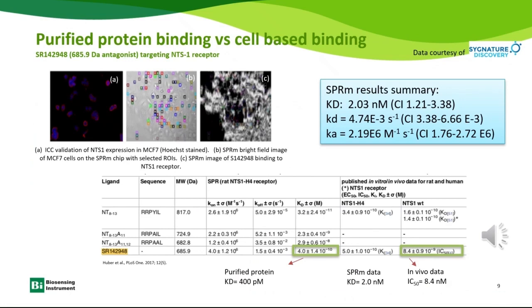This slide shows a comparison between the affinity measured on purified protein versus cell-based protein. The cell-based protein measurement was done by SPRM. Again, the result is shown on the top part of this slide, and in the middle is the optical image of the cells being measured.